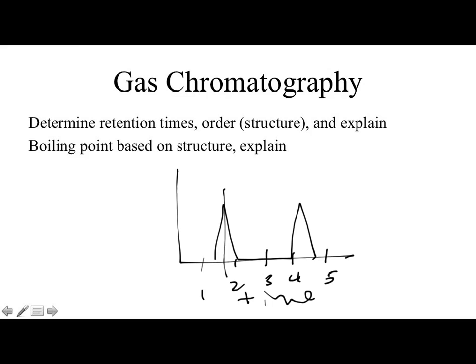So retention time for the first compound here is 1.5 minutes. What's the retention time for the second one? 4.5 minutes. So it's just reading it off of the graph. It's not where your compound first starts to go up, it's where you see the peak. Which, if you were in Robin's class, you never saw the peak. But there will be peaks. If you have questions about that, I can tell you what happened.